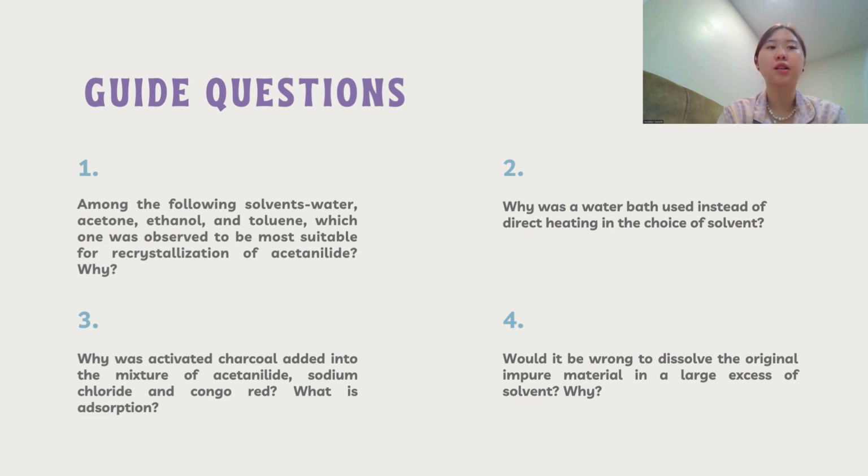Second was, why was a water bath used instead of direct heating in the choice of solvent? This is to maintain uniform or constant heating of the solution, and it is the preferred heat source for flammable chemicals to prevent sudden ignition with indirect conduction.